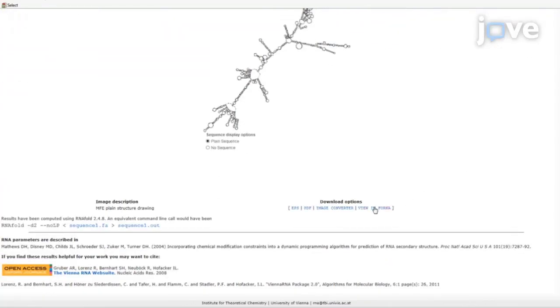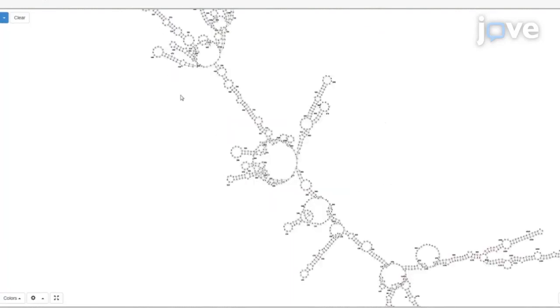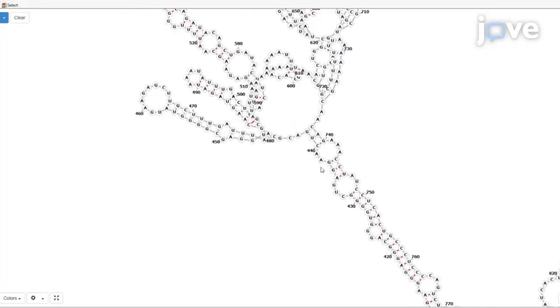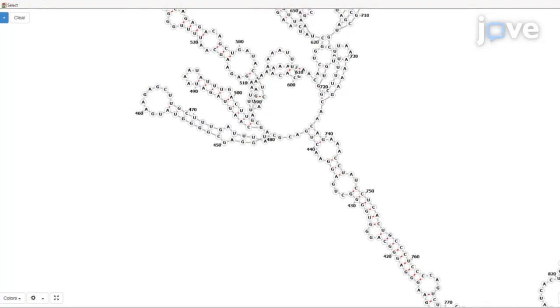Select at least 3 different 21 to 24 nucleotide long sequences within the mRNA of interest, preferentially in regions lacking extensive secondary structures and located in 3' untranslated regions. Select regions with a guanine-cytosine ratio close to 50% and lacking nucleotide tandem repeats to avoid potential formation of hairpins or self-annealing.